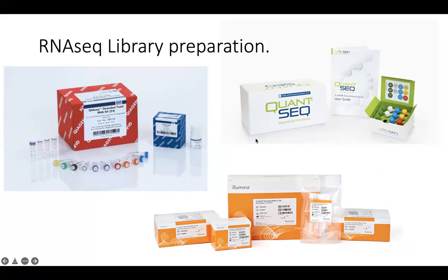And this is usually done with a kit. So here are some examples from different companies who have kits, which you can just buy, and then you can just go step by step through the protocols. And then your samples will be ready for the sequencing. So how does this actually work, this library preparation?